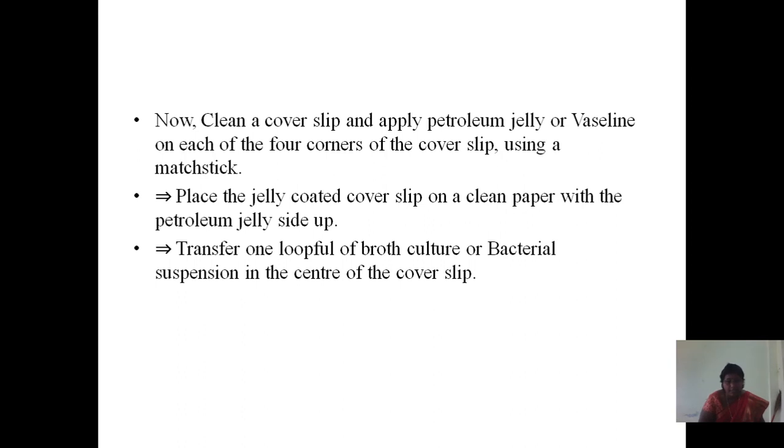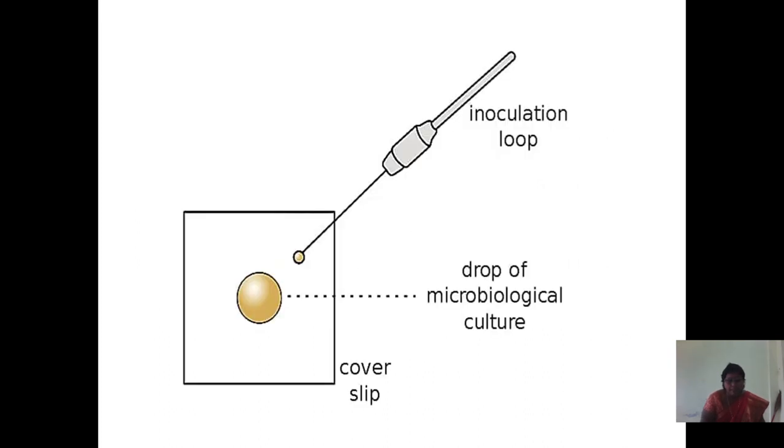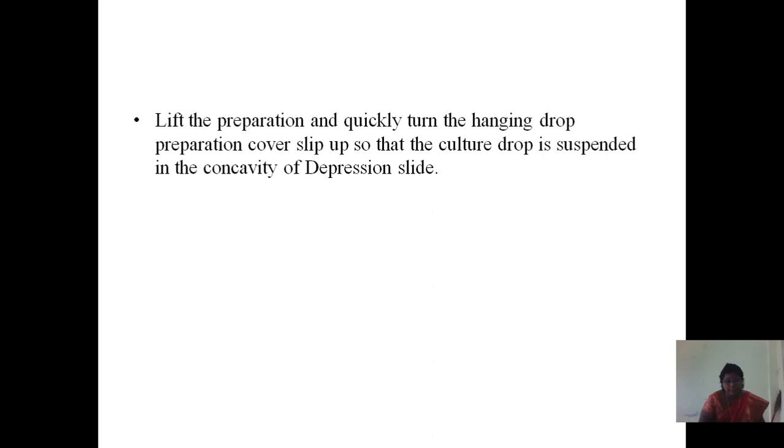Transfer a loopful of broth culture or bacterial suspension to the center of the coverslip. Note: the drop should not be too large or too small, and the size should be adjusted as per the dimensions of the coverslip and cavity slide. Place the depression slide onto the coverslip with the concavity facing down so that the depression covers the suspension drop. Press the slide gently to form a seal between the coverslip and the slide to prevent evaporation of the specimen. Then quickly lift up the depression slide and turn it so the hanging drop is suspended into the concavity of the depression slide.